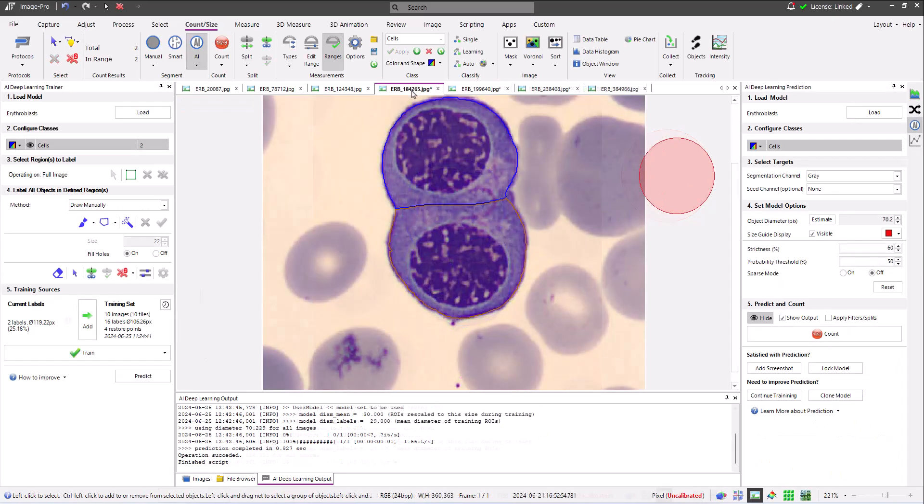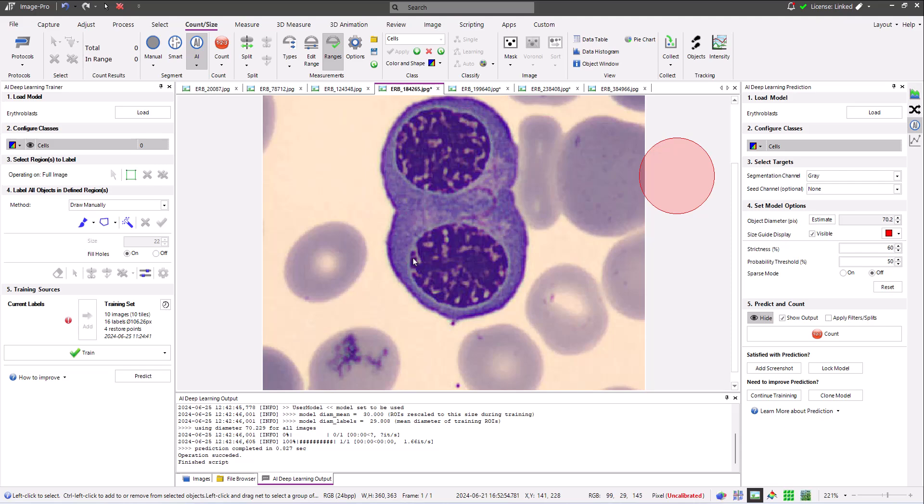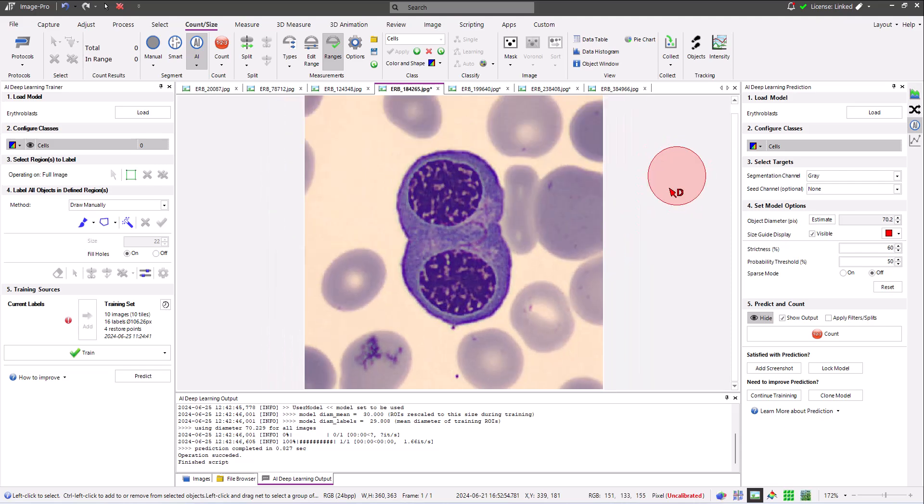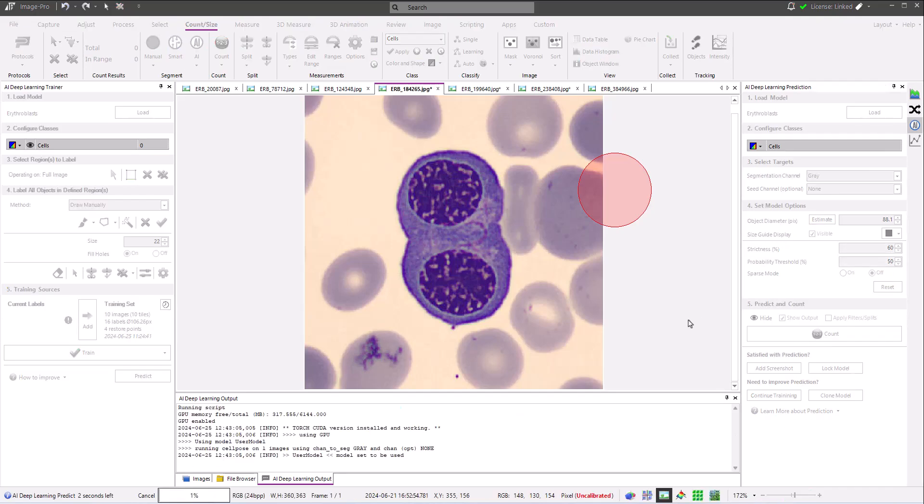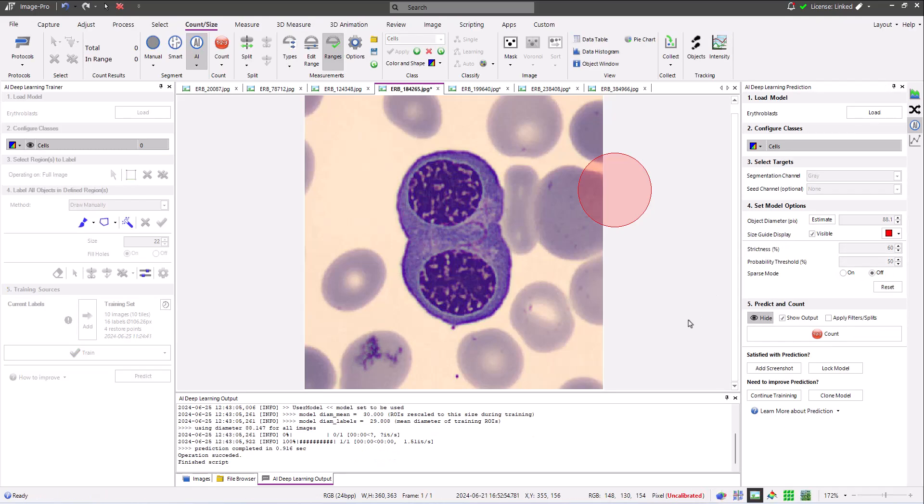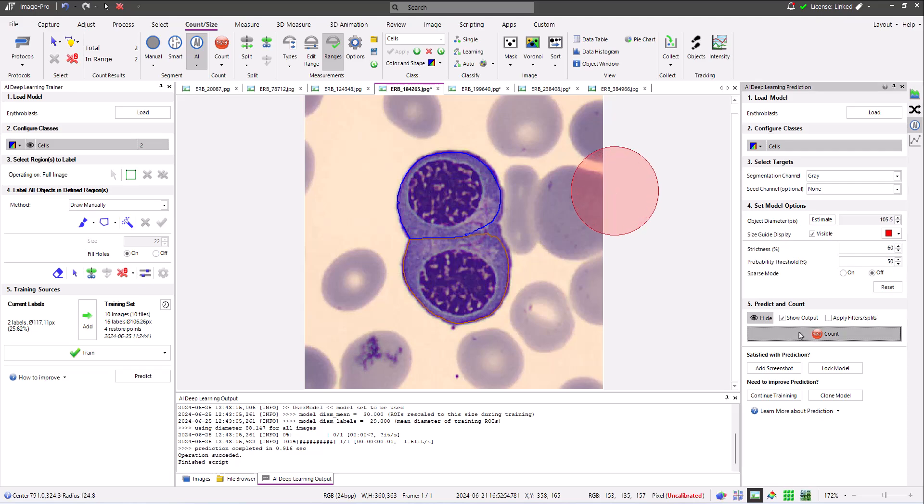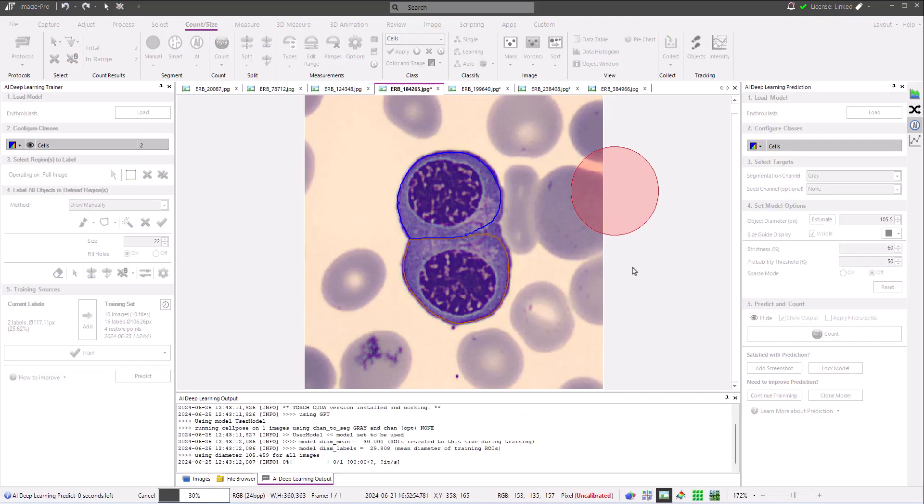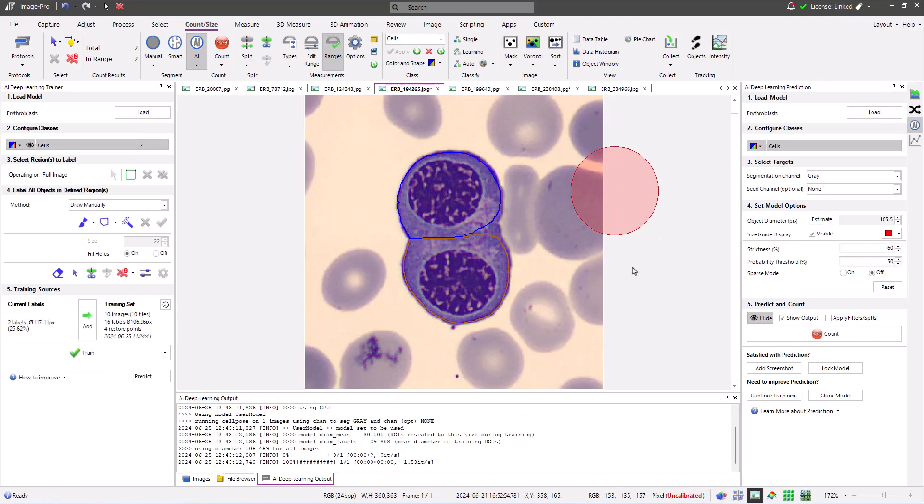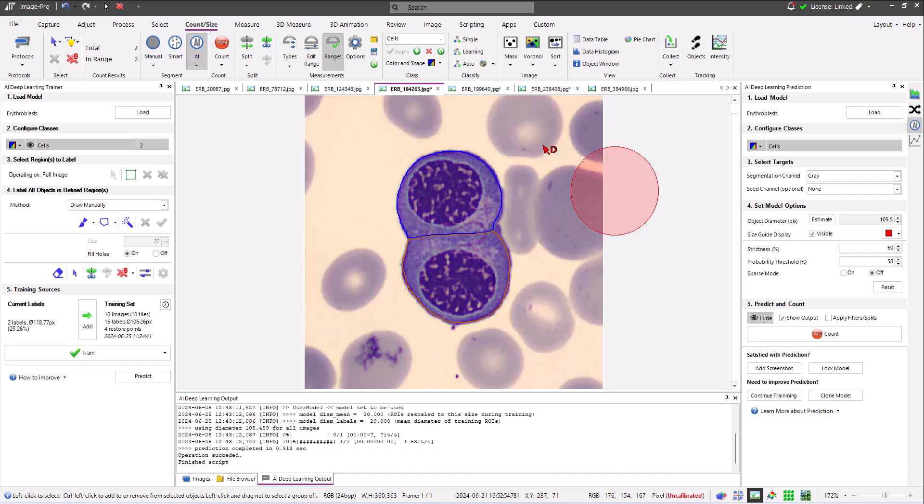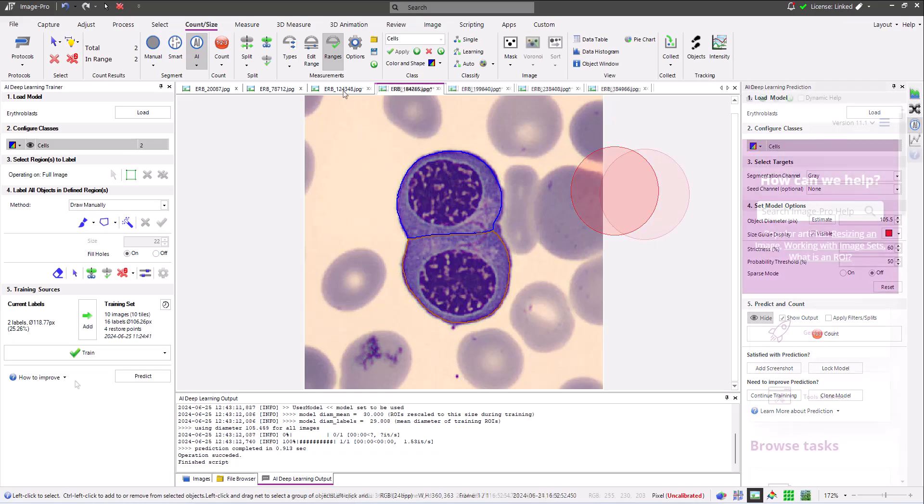A further round of model testing can now be done. Here the pair of erythrocytes that couldn't be found after the first round of training are found after the second. Based on your testing after each round of training, you can decide if your model is ready or whether further training data and training is required.